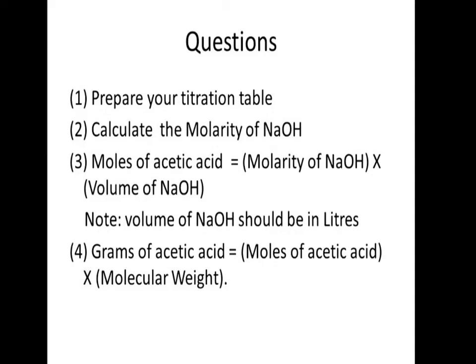You may be requested to calculate the molarity of the sodium hydroxide. You may be requested to calculate the moles of acetic acid. This can be done by using the formula molarity of sodium hydroxide times volume of sodium hydroxide. You can be requested to calculate the grams of acetic acid. So these are what you can be requested to do.